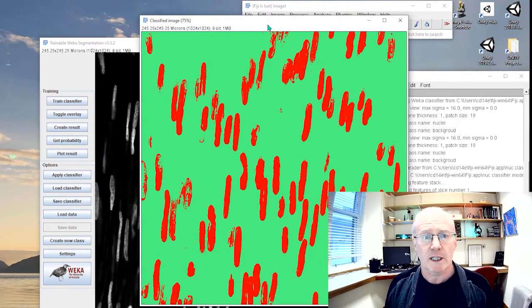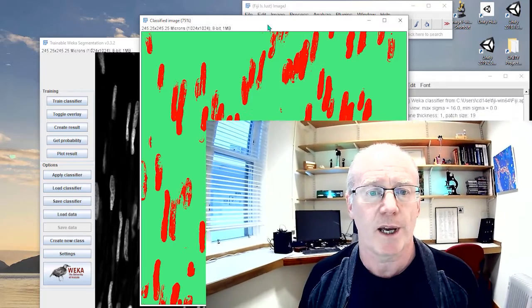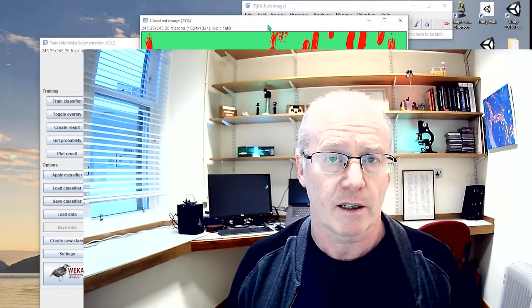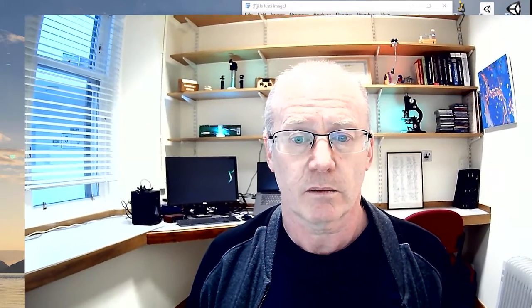So that's a very quick and easy way to train a machine learning algorithm. You can spend more time going through the iterations, but I think what's nice about trainable Weka segmentation is that it gives you the basics of what is required to train an algorithm. Load an image to tell the segmentation algorithm what's a nucleus, what's a background, save it and run it on a new image. I hope that was useful and I'll catch you next time.